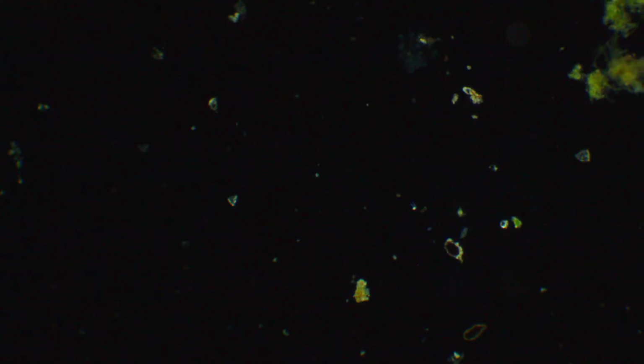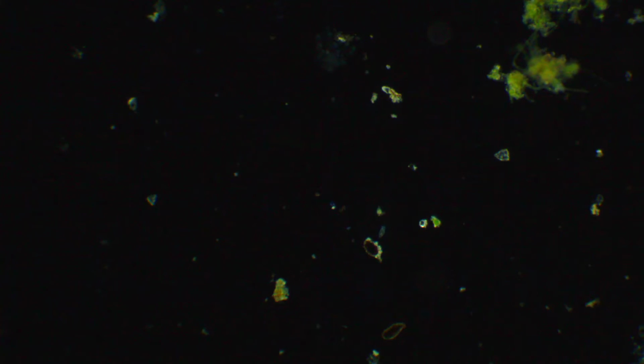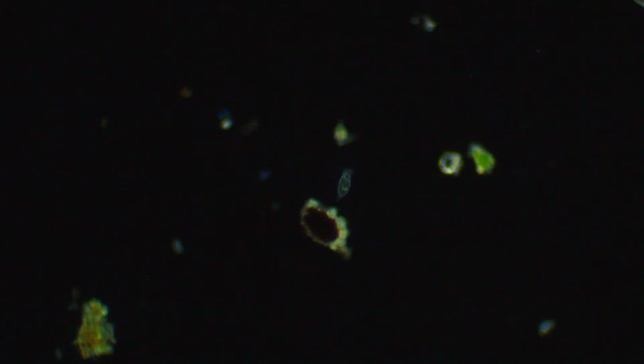I could sit there and try to follow him around, but oh, look. Okay, here we go. If he's alive, which I can't tell if he is... Ah, yes. Hello, little rotifer. Hello.